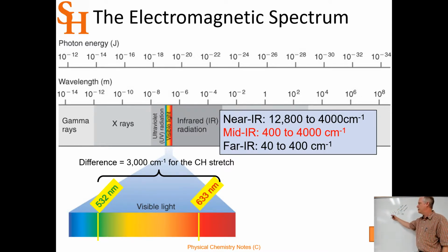And so the neodymium atom is doped into this structure. And it's the energy levels of the neodymium atom that cause the laser. So we can hit it with a flash lamp, cause a population inversion, and then stimulated emission will produce a coherent beam of light. And that beam is at 1064 nanometers. And that's in the infrared. So we could do spectroscopy with that directly, but it's not really tunable. It's just stuck at 1064 nanometers.